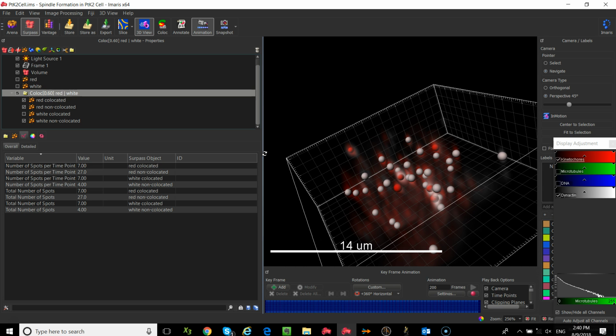Okay. We're 5 minutes over, but does anyone have any questions before the next group comes in? Does this also sort of work on, say, two surfaces? Absolutely. So we have an extension called surface-to-surface colloc that can be used for that exact same purpose. Okay?